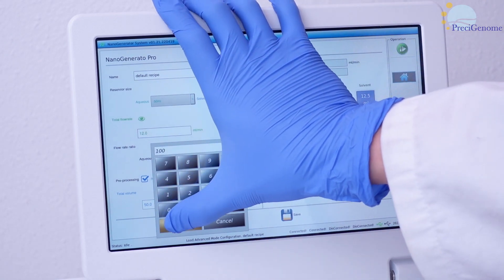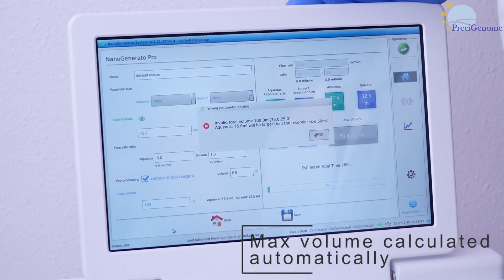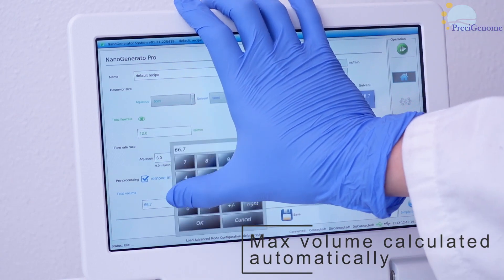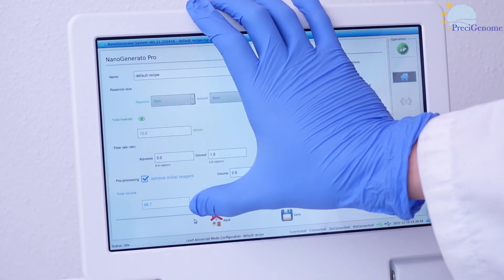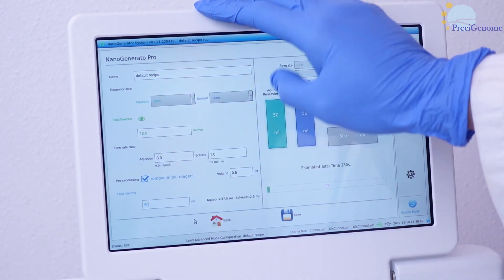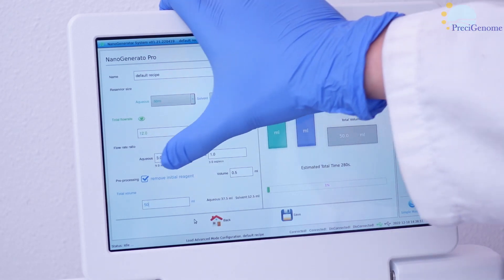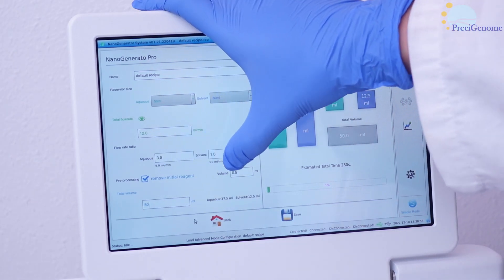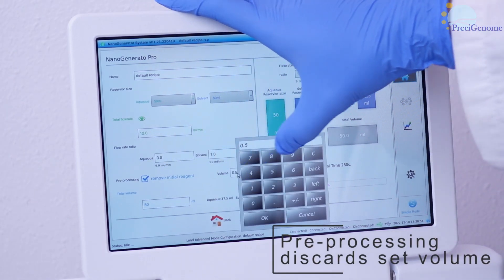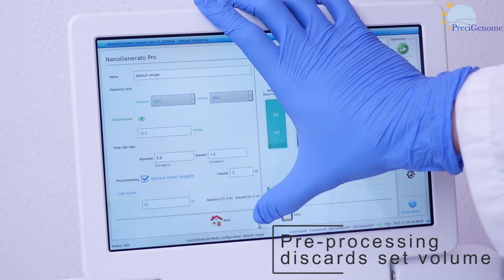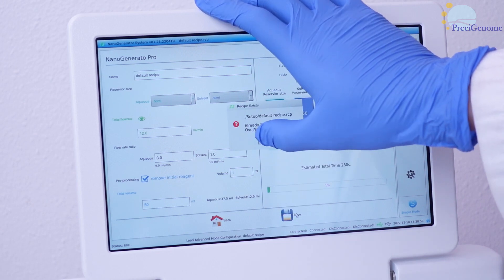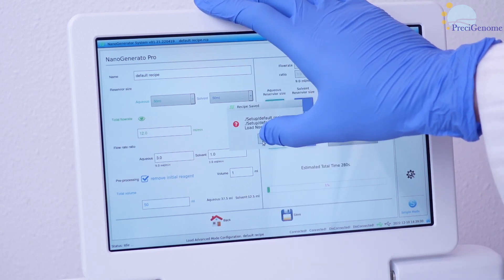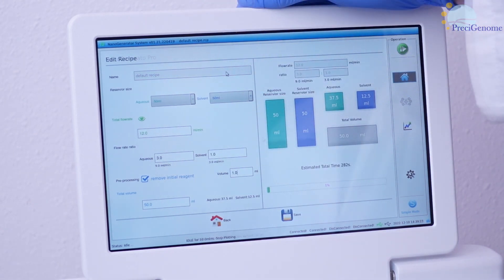If the target volume is too large, the Pro will instead use the highest possible value. If desired, you can remove the first fraction of your product with pre-processing — the Pro will automatically send the specified volume to waste before collecting the rest. When you are done setting your parameters, simply save the recipe and it is ready to go.